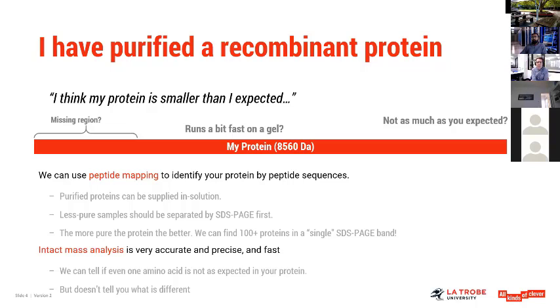That's basically because SDS-PAGE doesn't separate things out as well as it looks by Coomassie staining, and there are traces in there that we can still pick up. But generally, as always with mass spec, the purer the protein sample is, the better for us.